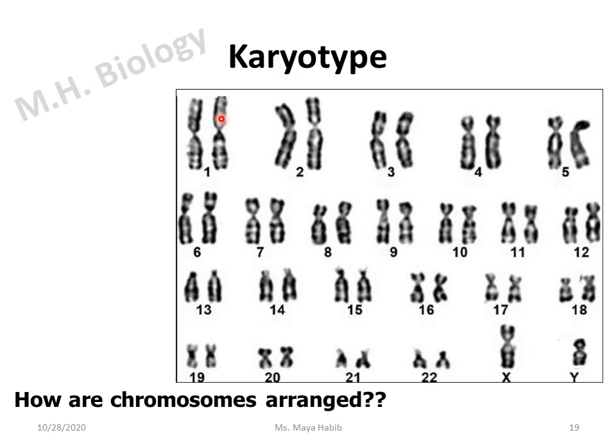Of course human diploid cells contain 22 types of autosomes, and there are 2 copies of each autosome, so normally there should be 44 autosomes. Moreover, these cells contain 2 gonosomes, and we can see them in this karyotype: 1 X and 1 Y. So, in total, there are 46 chromosomes arranged as 23 pairs. The autosomal chromosome pairs are arranged in decreasing order of size, from largest to smallest, and then we put the gonosomes.